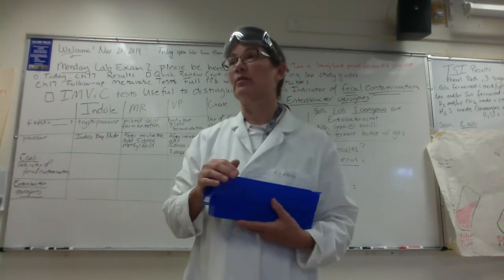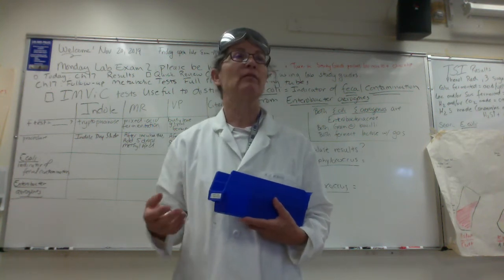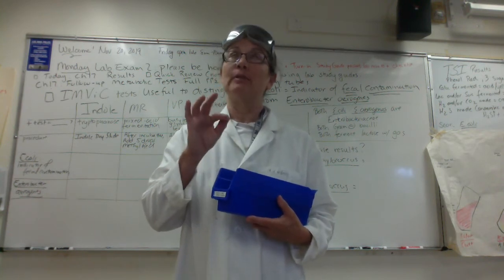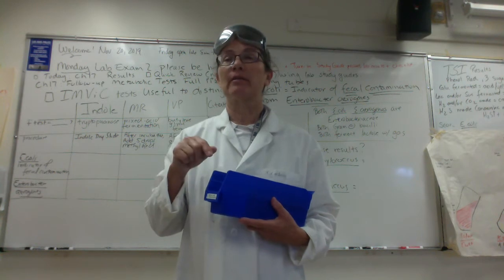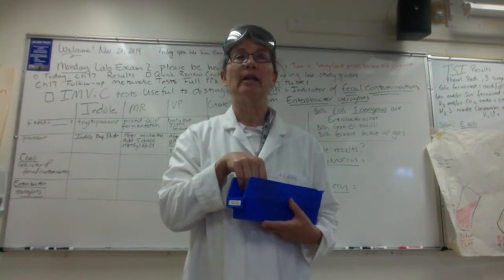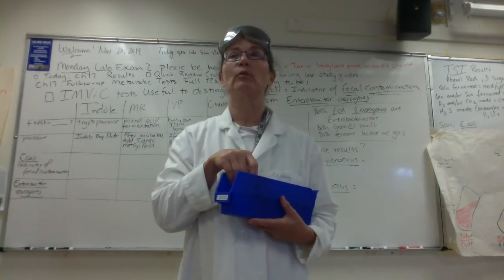It'll kill the microbes, right? So we have to let them grow and ferment and then add the methyl red pH indicator. Now, folks, it's easy for me to confuse phenol red and methyl red. Methyl red pH indicator turns red at really low pH, below 4.4 to 4.8.